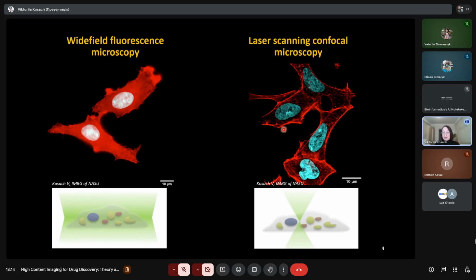In confocal microscopy, to avoid this background light, there is an aperture filter that has a pinhole in it that focuses the light in one very small point in one focal plane, and actually it blocks out the fluorescent emission from the background or non-focal plane. So in that case you receive a very nice image, very strict, very detailed.